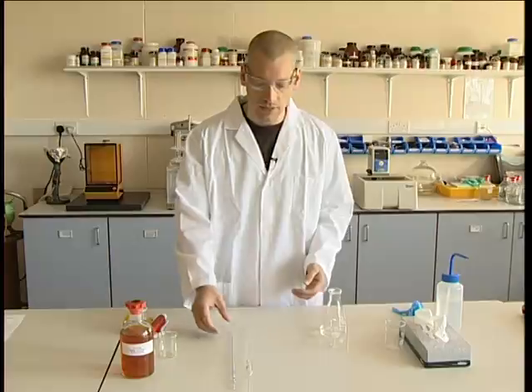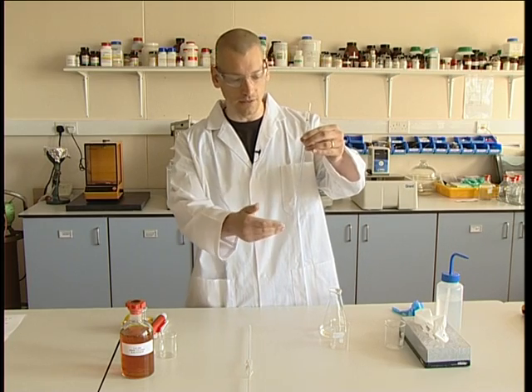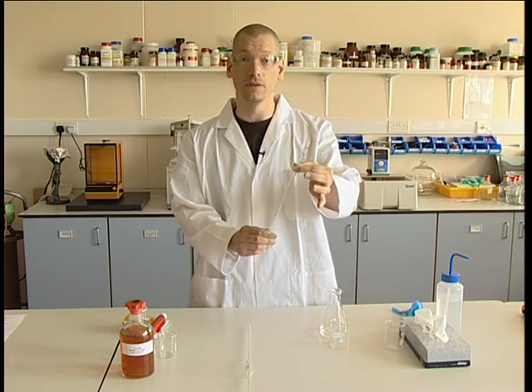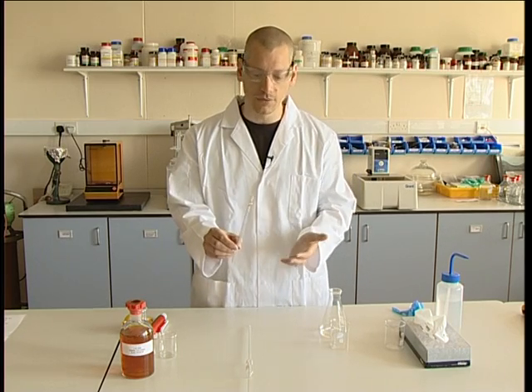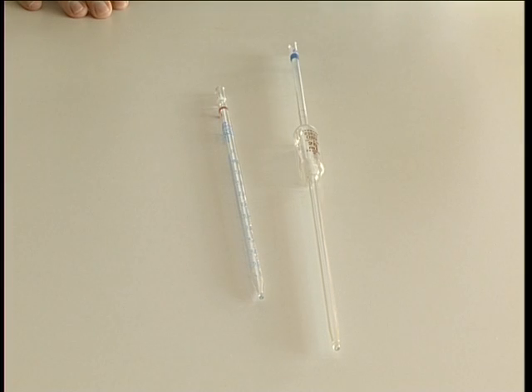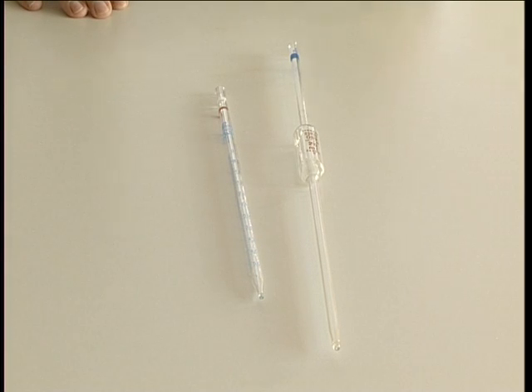There are two types of basic pipettes. The first one is a graduated pipette — a series of scales on the side in which you can measure a preset volume. This isn't so accurate as the other, which is a volumetric, which you mainly use for analytical work. If we want a more accurate way of dispensing liquids, we need to use the volumetric pipette.